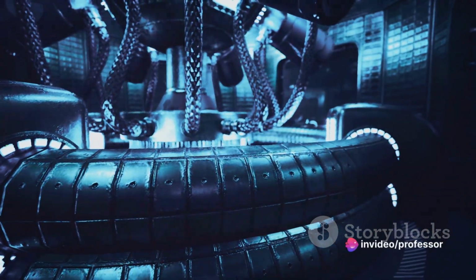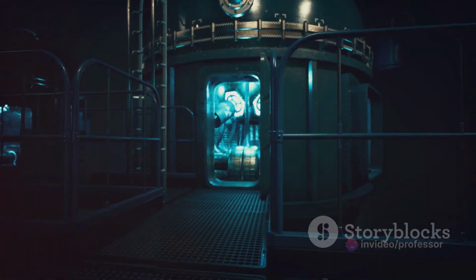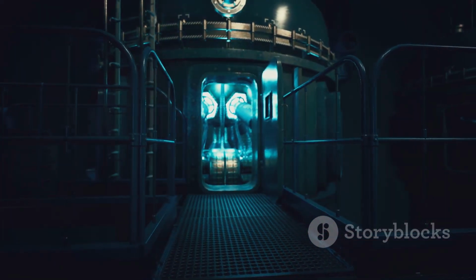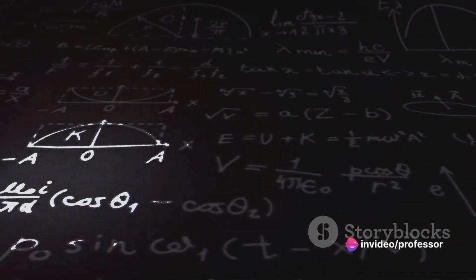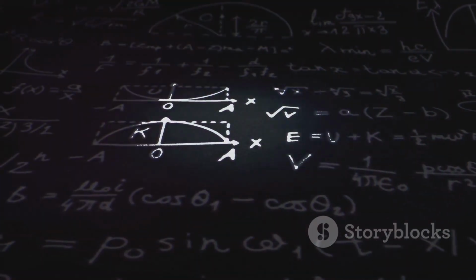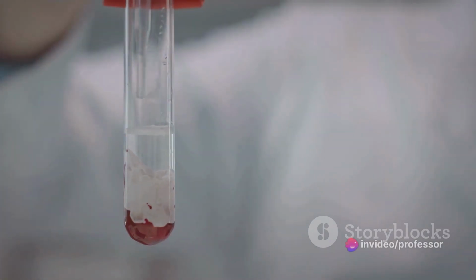Well, it's a crucial factor that influences the conductance measurement in conductometry. The cell constant, often denoted by the symbol K, is the ratio of the distance between the electrodes to the area of the electrodes. It's a measure of how the configuration of the cell influences the conductance. In a nutshell, the cell constant gives us an idea about the efficiency of the cell. A lower cell constant means the cell is more efficient in conducting electricity and vice versa.